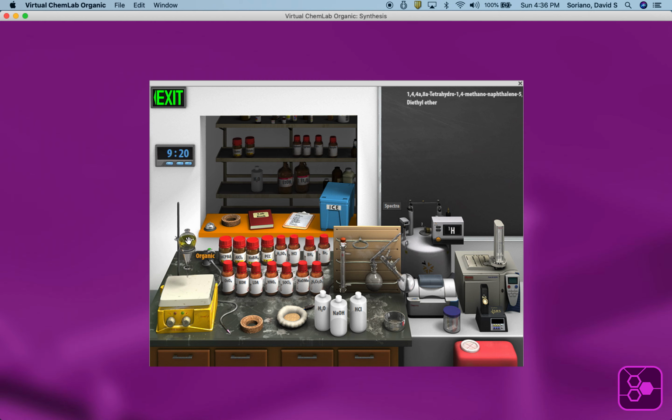So what we presume to do, we take that top layer, go to the evaporating dish, crystallizing dish, and we would allow that to evaporate. The diethyl ether has evaporated, presumably in the hood. You see that yellow solid? Now, we can do an infrared of that.